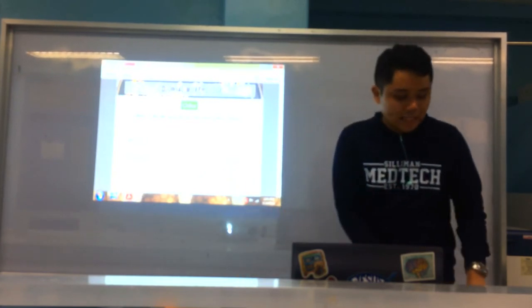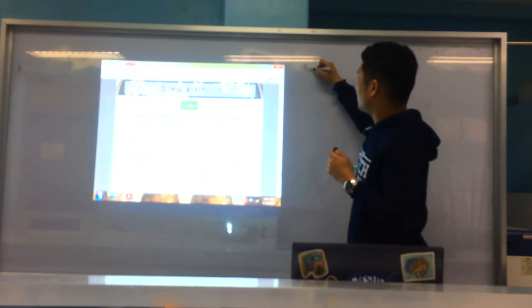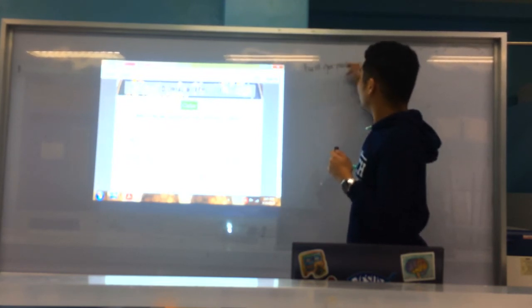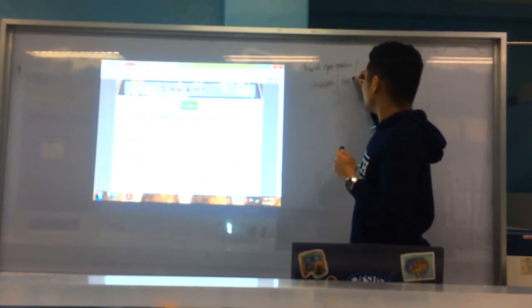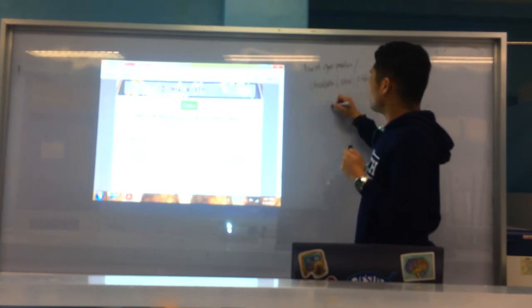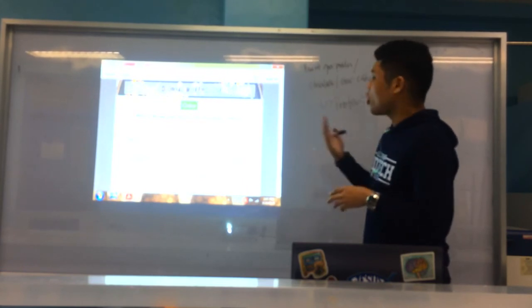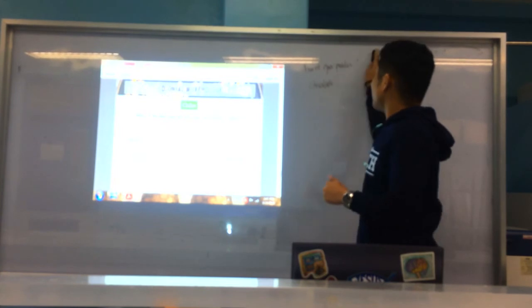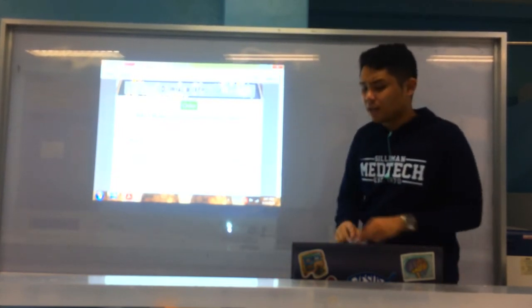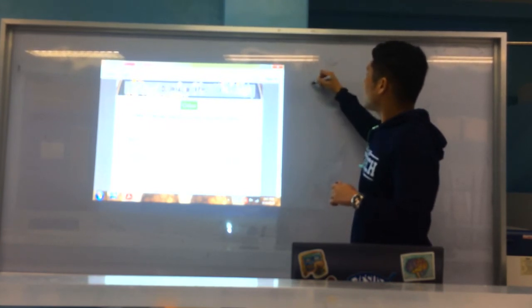Other organisms are not on the slide, since I can't edit it because it's a PDF. Other odors, for example, burnt gunpowder, chocolate, or chocolate cake. Who is that? Proteus. Please take note. Proteus: burnt gunpowder, chocolate, or chocolate cake odor. Another one is apple odor. This is Alcaligenes.